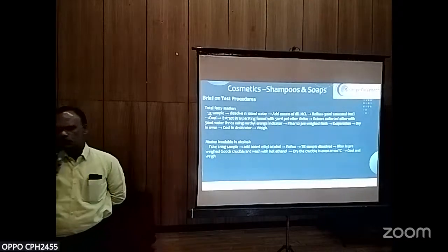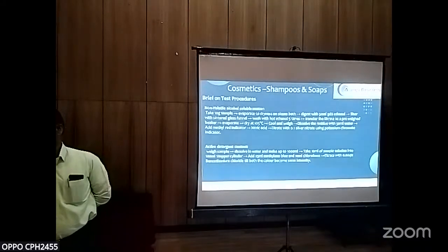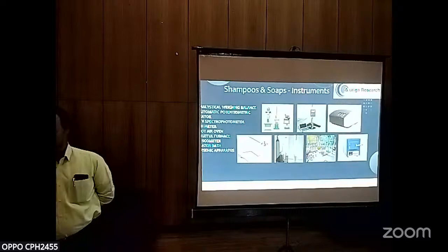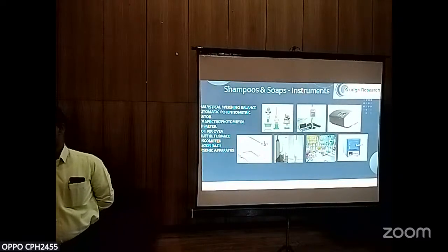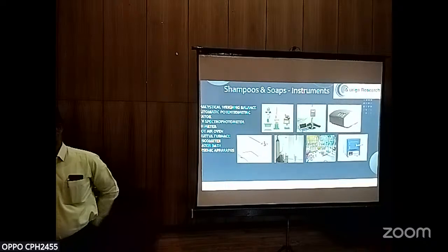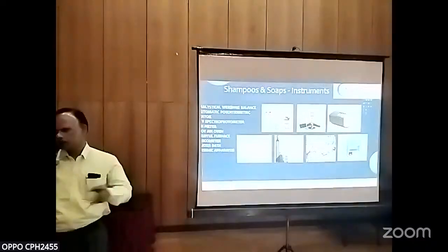These are the instruments utilized to perform this: the balance, oven, spectrophotometer, pH meter, hot plate, burette, pipette, and beakers and other glassware. These are the instruments required to perform all these.